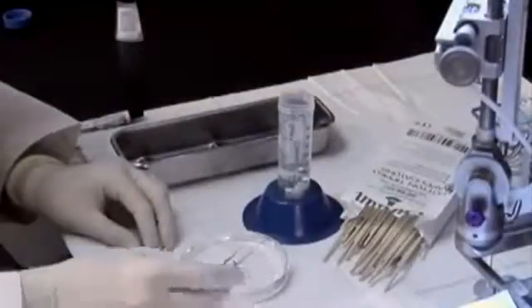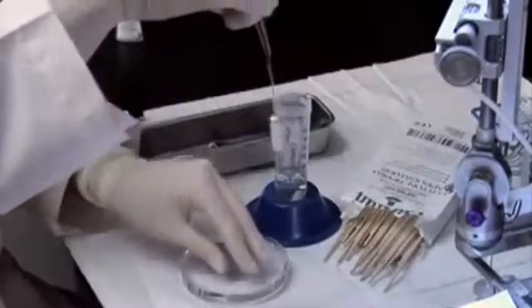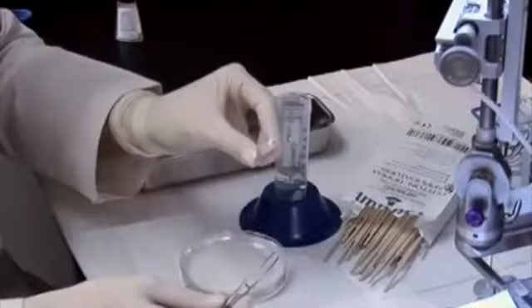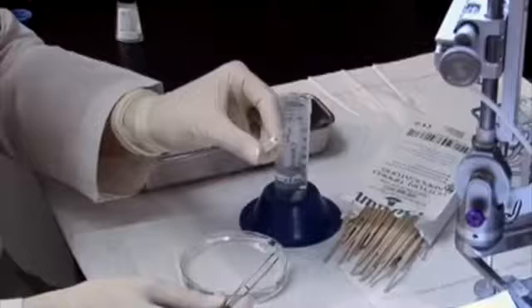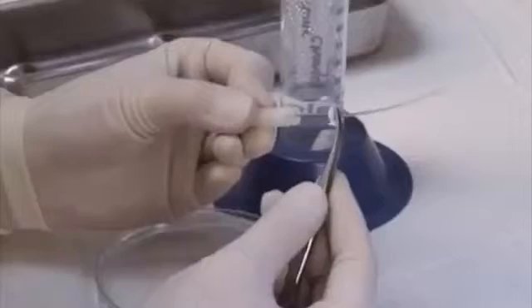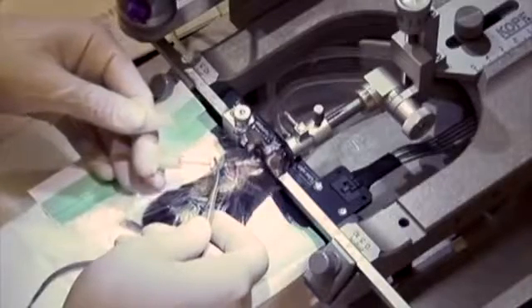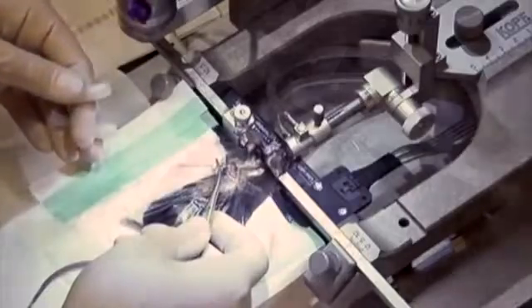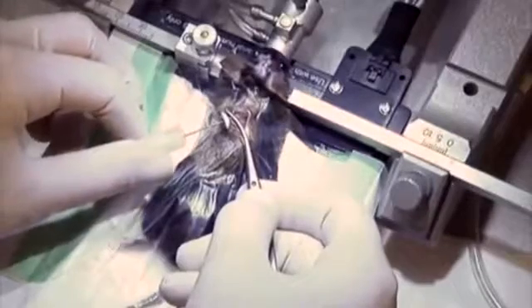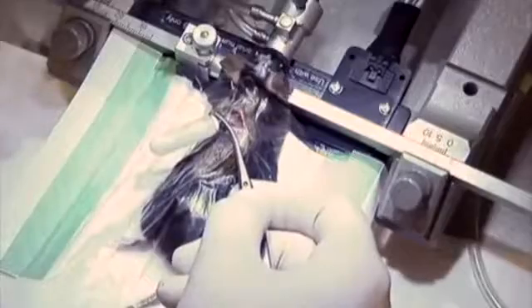Dab antibiotic ointment onto the sutured skin and place the mouse on a heated recovery pad. If changing the pump, have the fresh pump ready along with a 10 cm dish filled with 95% ethanol. Use forceps to grasp the new pump, then dip the fingers of the other hand into 95% ethanol and take hold of the pump. Discard the new pump flow modulator and carefully pull off the old pump from its flow modulator attached to the tubing and cannula. As soon as the old pump is off, slowly slide the new pump on, ensuring that the flow modulator never touches the outside of the mouse.